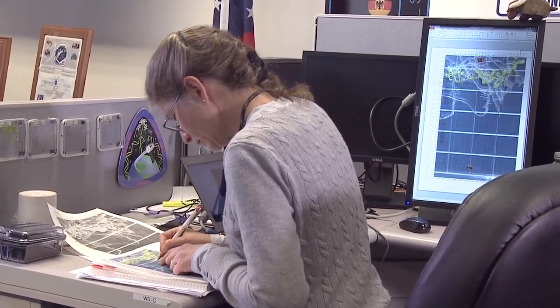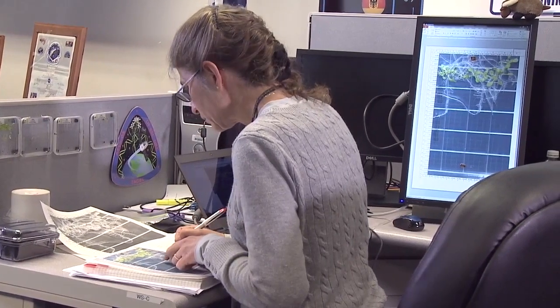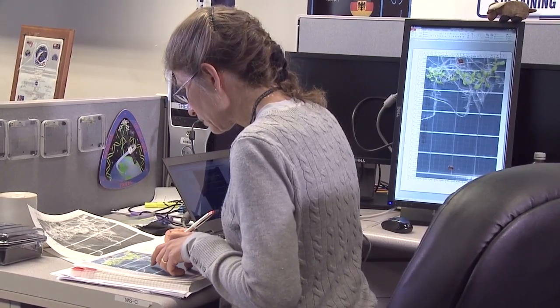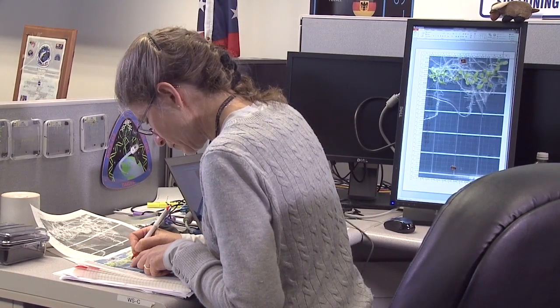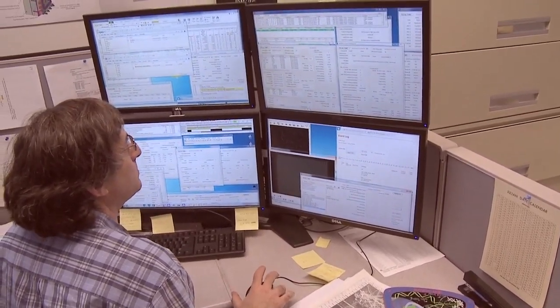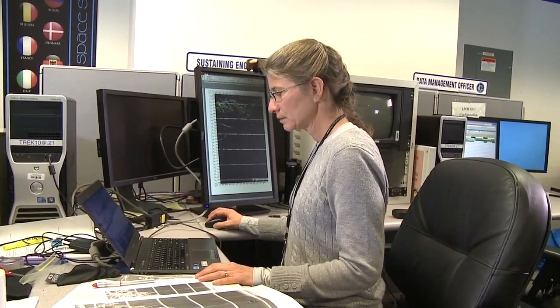As a laboratory, we are plant molecular biologists. We're interested in spaceflight as a novel environment, something that's outside the evolutionary experience of plants. What the Apex 3-2 experiment does is look at Arabidopsis thaliana and how it responds at the molecular genetic level, as far as what genes are turned on and turned off biochemically, and also using live imaging with the LMM, Light Microscopy Module, to look at specific reporter genes we've engineered to give us specific locations for where these genes are active in real time.